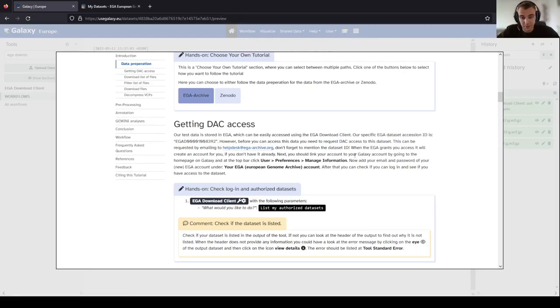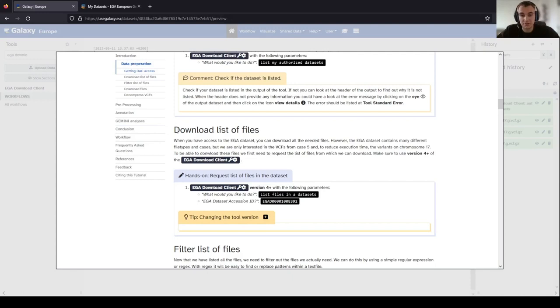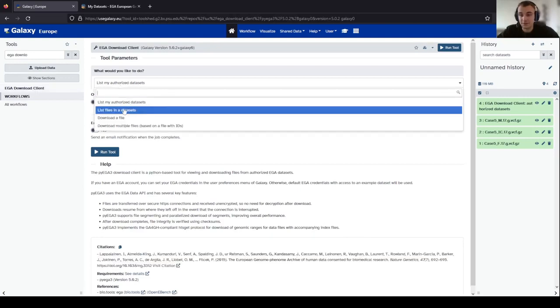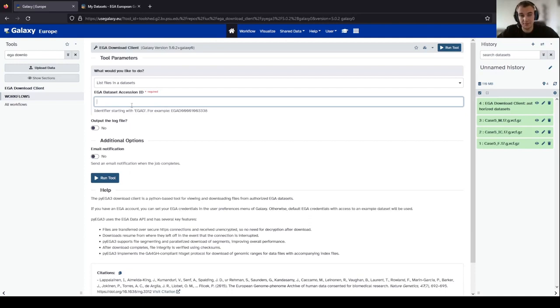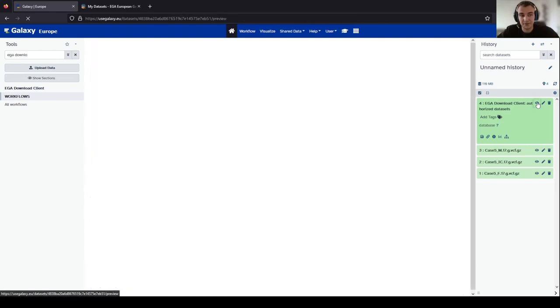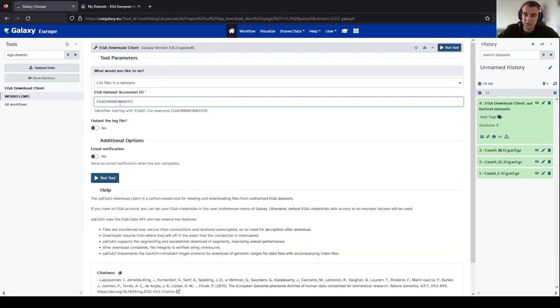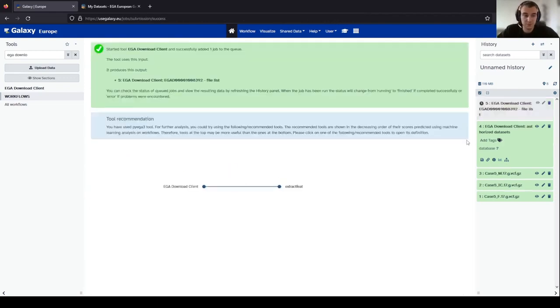Going back to the tutorial, we can start the next task of downloading the list of files from the dataset. Each dataset has multiple files, and first we have to request the list of files to see what we want to use. Click again on the EGA download client, select 'List files in a dataset', and then add your accession ID, which we can find from the listed dataset. Paste the dataset number and run the tool. This might take some time depending on the amount of activity on the EGA archive site.